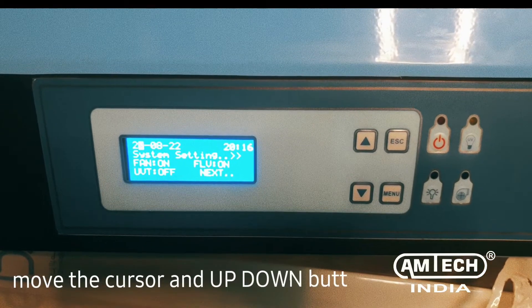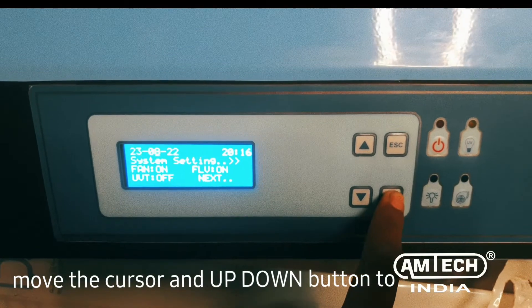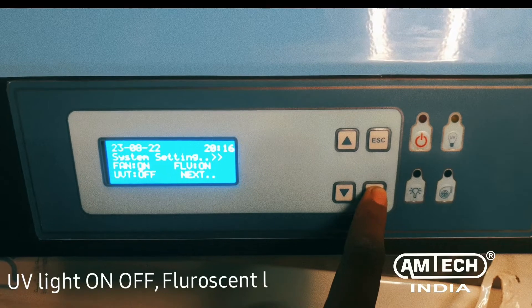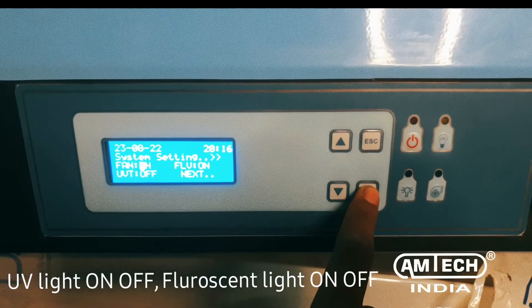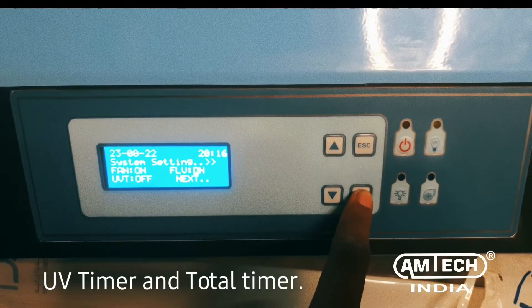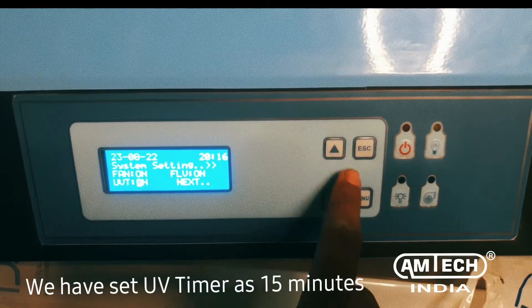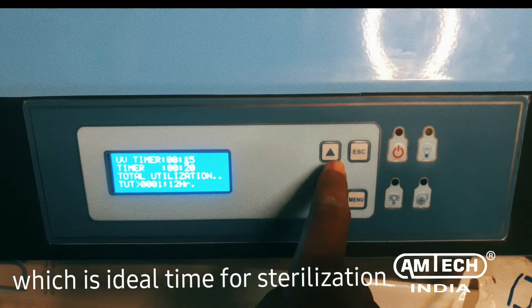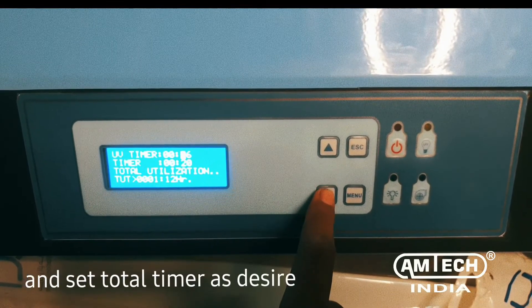Use the menu button to move the cursor, and the up/down buttons to change the values for date, time, UV light on/off, fluorescent light on/off, UV timer, and total timer. We have set the UV timer as 15 minutes, which is the ideal time for sterilization, and set the total timer as desired.